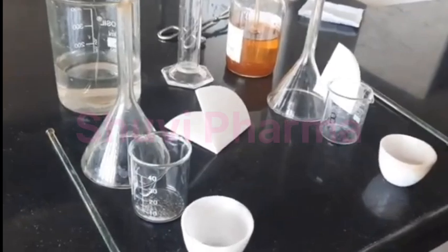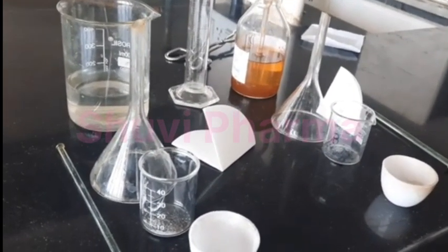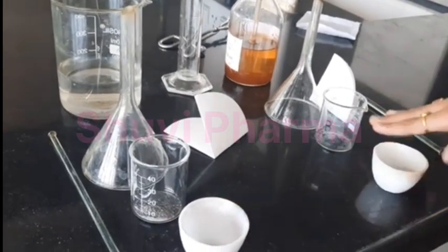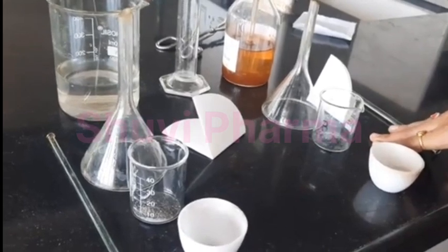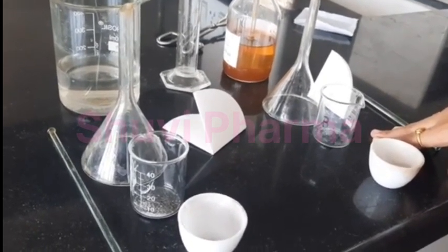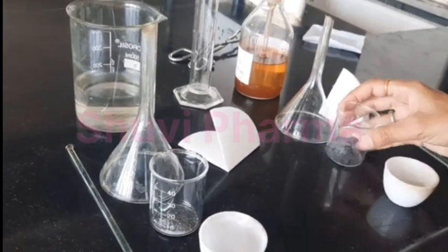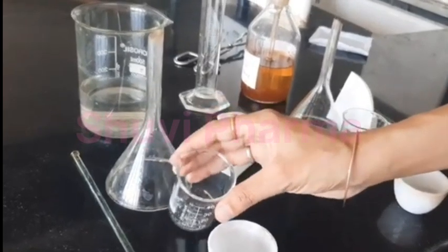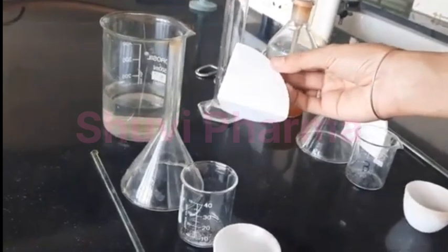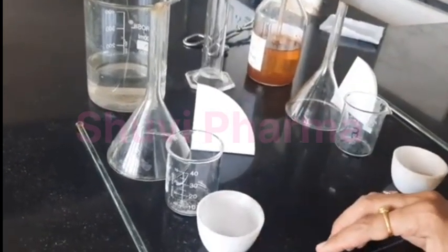So these are the requirements to calculate the acid insoluble and water soluble ash. Okay, so we have divided our total ash in two parts, that is 0.08 gram for water soluble and 0.08 gram for acid insoluble. In case of acid, we are going to use 25 ml of 2 normal HCl and 25 ml of water for water soluble ash. Now we will add acid to this and water to this, that is 25 ml, and we will boil for 5 minutes. Then we will filter this through ashless filter paper, and we will put this filter paper into the crucible and we will incinerate at 450 degrees Celsius.